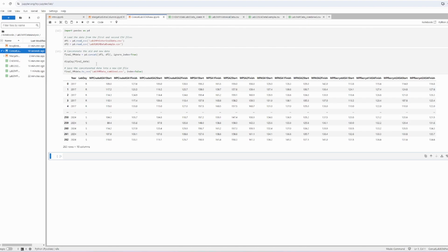My preference is to call them in on one single file, and then each of these different sets of data here that are part of one group is kind of a level, it's called. So this is group R and this is group S and so on. If we want to compare group S to group R, I can do a group by function, pull out this data specifically, and then refer to specific columns.